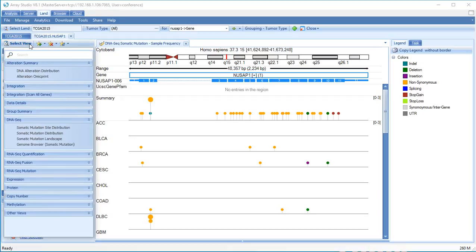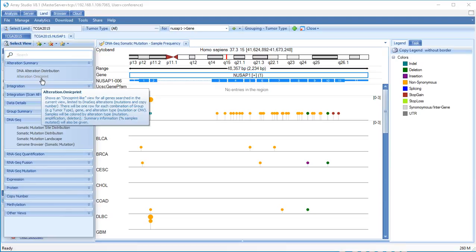For RNA-seq data, gene expression data can be displayed along with exon usage as well as fusions and mutations that were detected. RNA-seq expression data in Oncoland were processed from raw FASTQ files in a common pipeline, log2 transformed, and quantile normalized to allow for comparisons between samples.